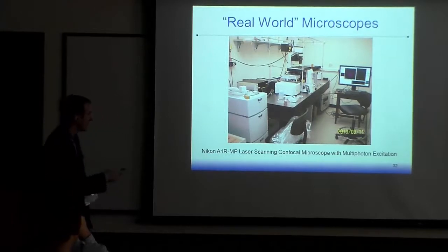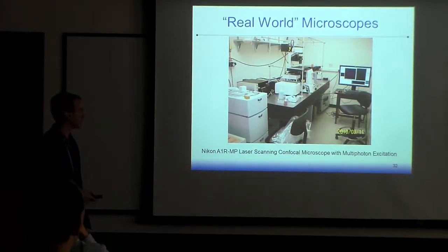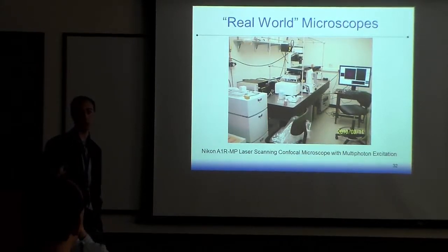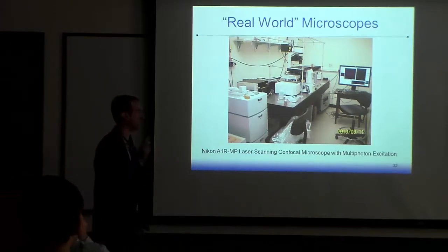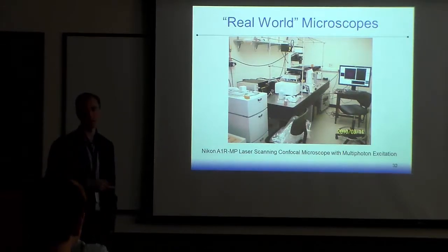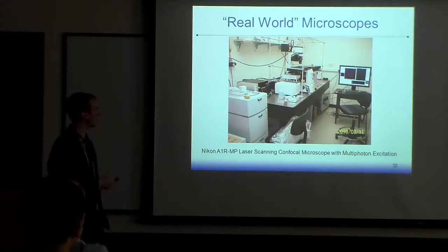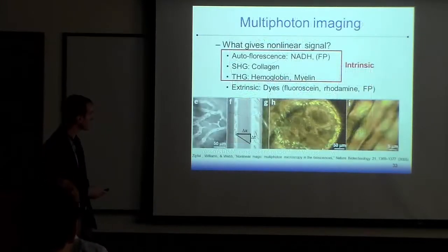Okay, and so there's commercial systems. These are things you can buy. Olympus sells them, Nikon sells them, and here's an experimental setup. You have a Ti-Sapphire laser sitting in the back over here, computer controlling it, and then it's basically just like a commercial confocal setup that they just modified and sell for $500,000, 5 times the cost of the laser, just because they can. But they're selling a bunch of these, and hospitals are getting these now, pathologists are getting these now. Mostly universities, researchers are working on this.